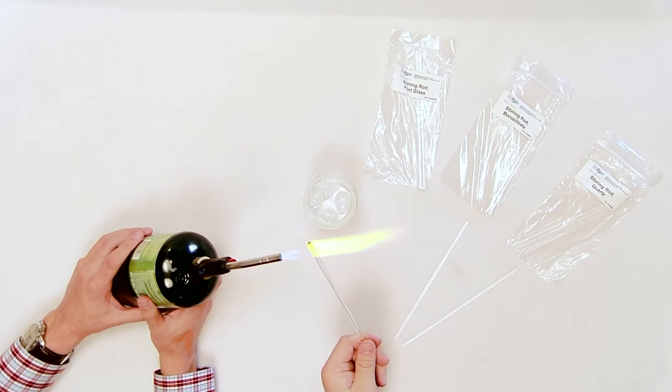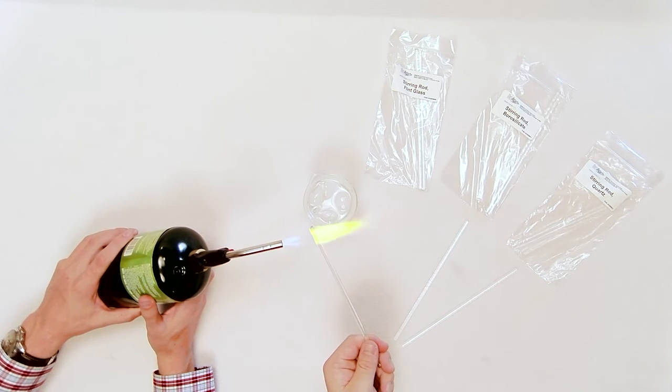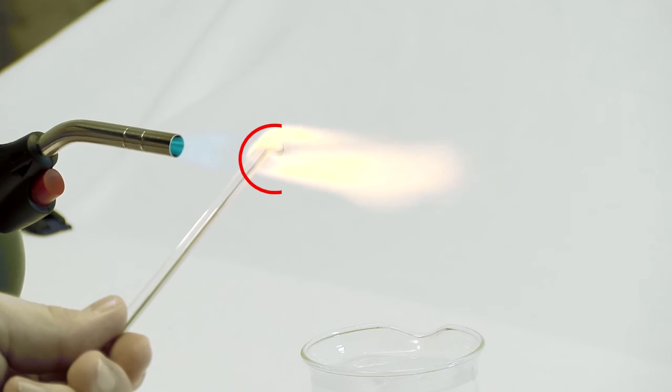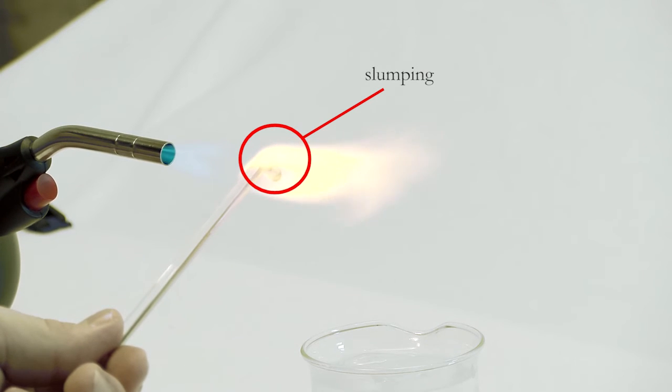Try to hold the glass rod so that the same length of glass is in the flame throughout the heating. Point out the sodium flare that occurs as the glass heats up. Allow the glass to sag or slump to show softening.